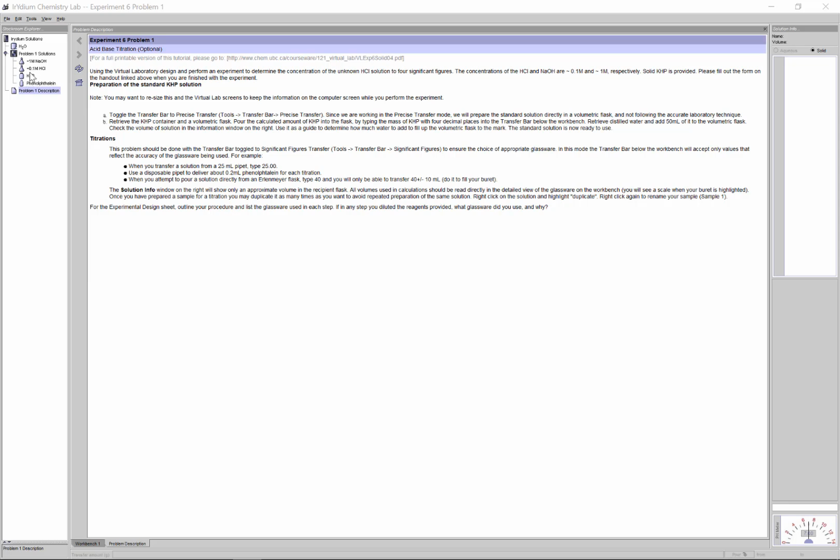This one, unfortunately, starts off as solid. I'm going to make a solution with this acid powder. Using this acidic standard, in part one, I'm going to find the unknown concentration of NaOH. Once I know the concentration of NaOH very well, in part two, I'm going to use this base to titrate against the acid. Now, one added note here is I noticed that the HCl is about 10 times less concentrated than NaOH. I'm going to perform for you a dilution just to bring the concentrations roughly equal to each other, so then I'm not wasting tons and tons of solution. So just let me introduce this for you here.